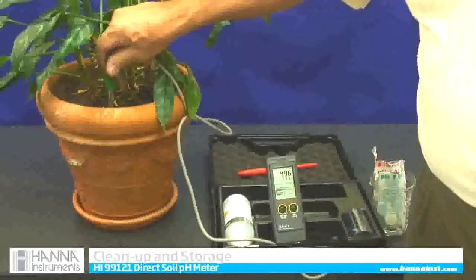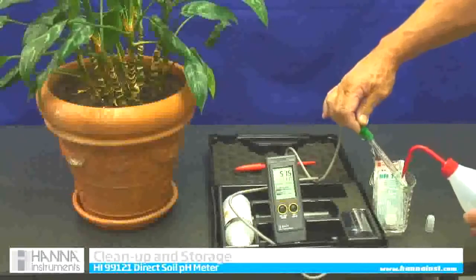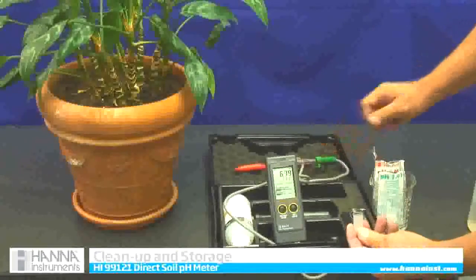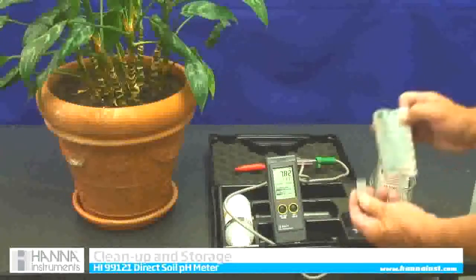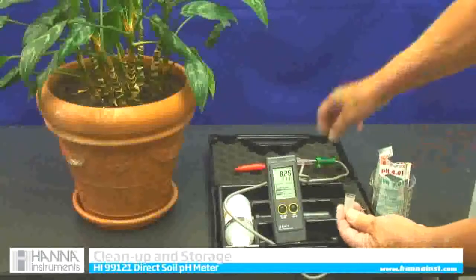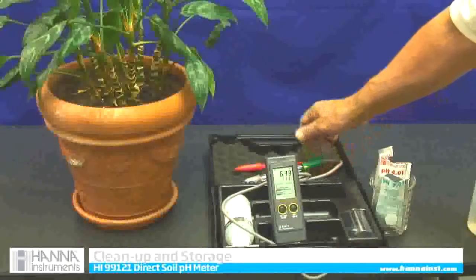Now to store the probe, I am going to take it out of the soil and rinse it off. What comes in the kit is this cap — a nice little cap. I am going to take one of my buffer solutions; it does not matter if it is the 7 or the 4. Put a couple of drops — you don't need much. Then store the cap.